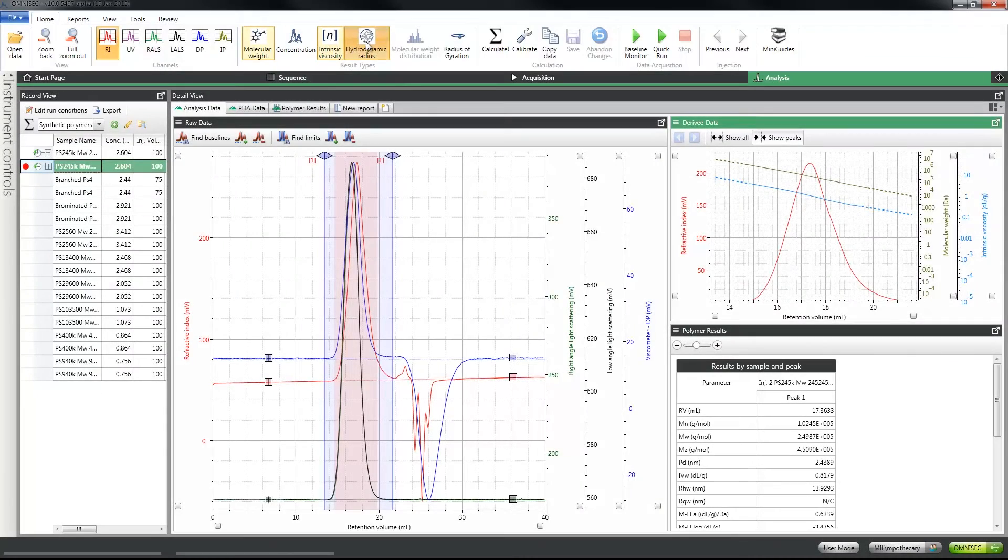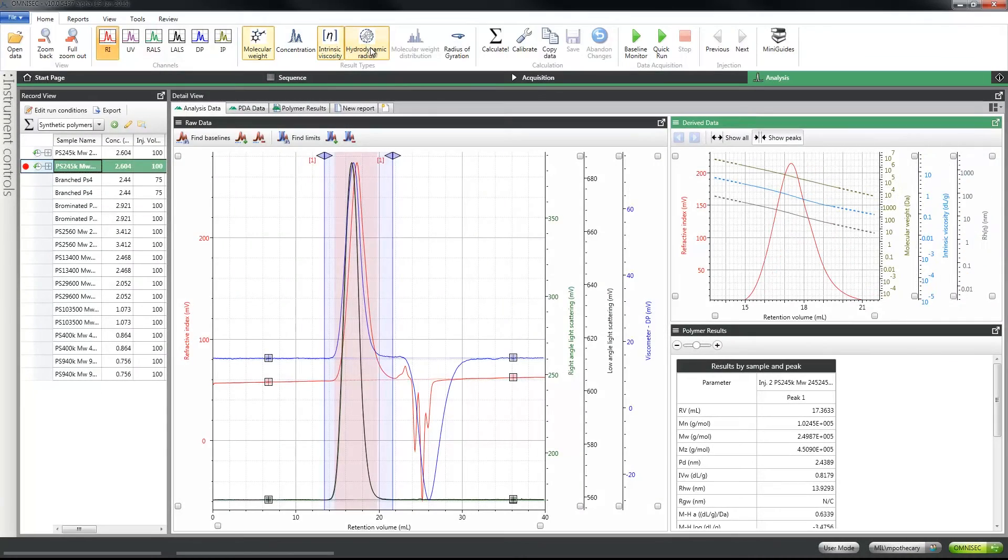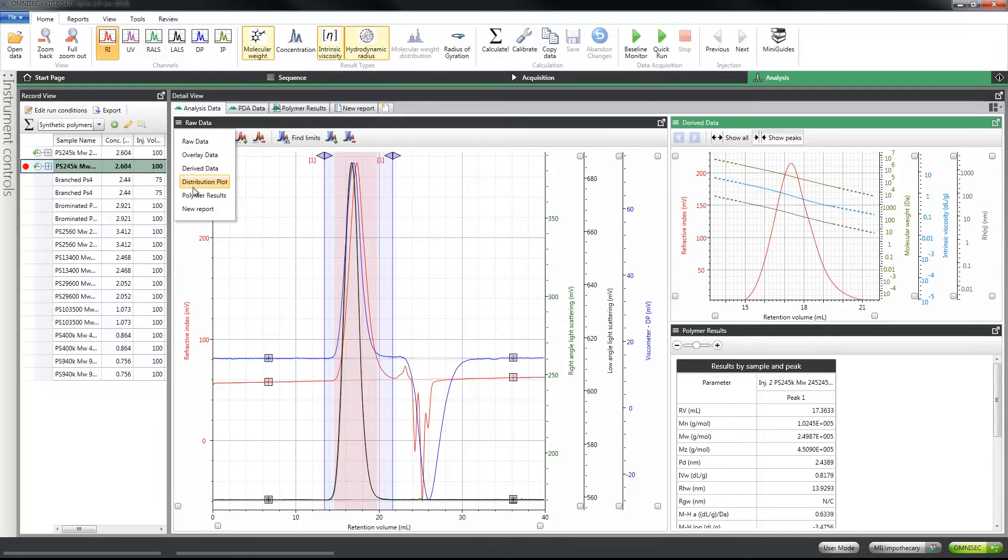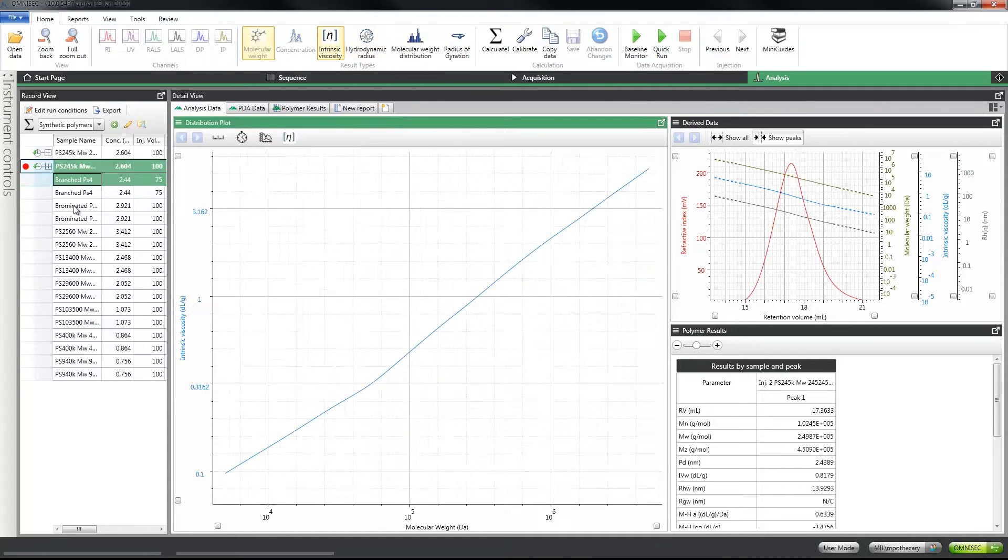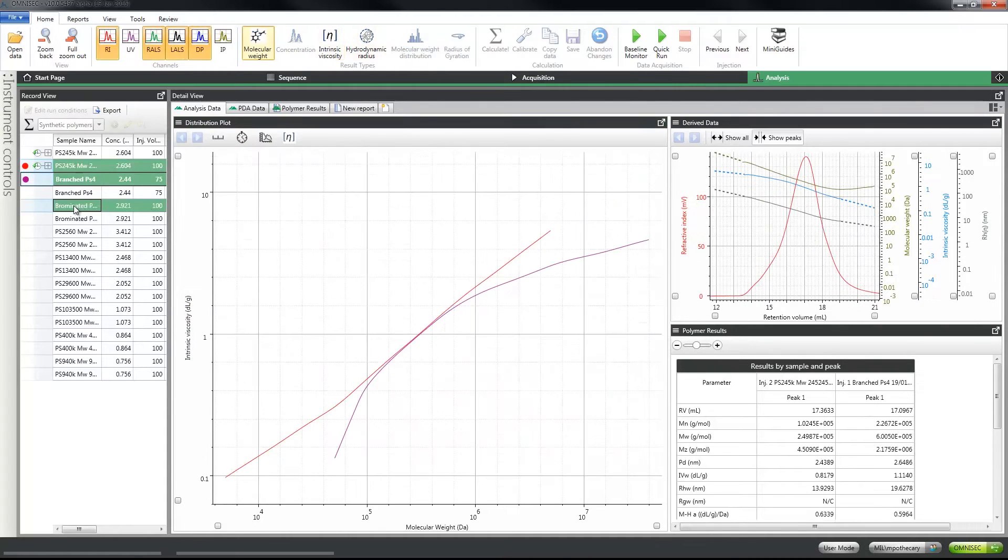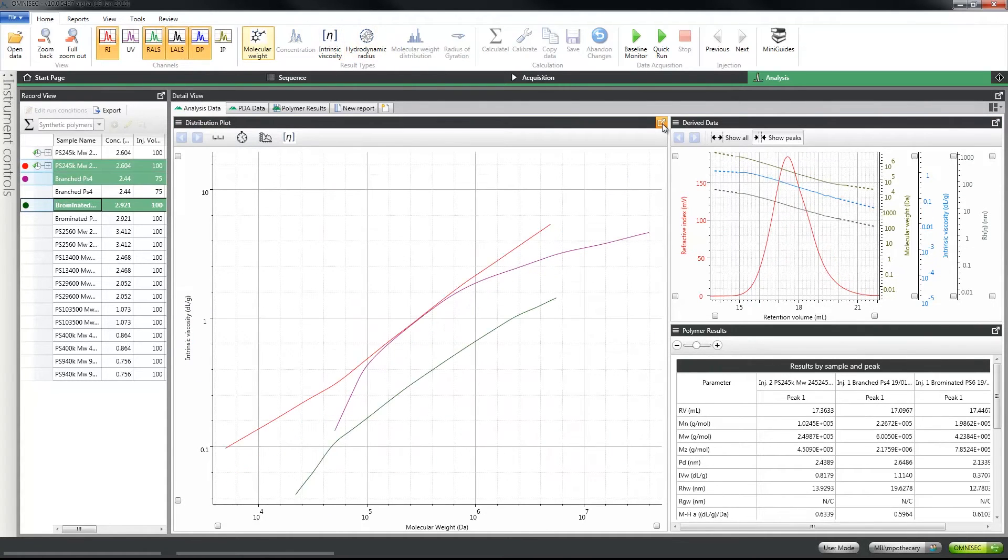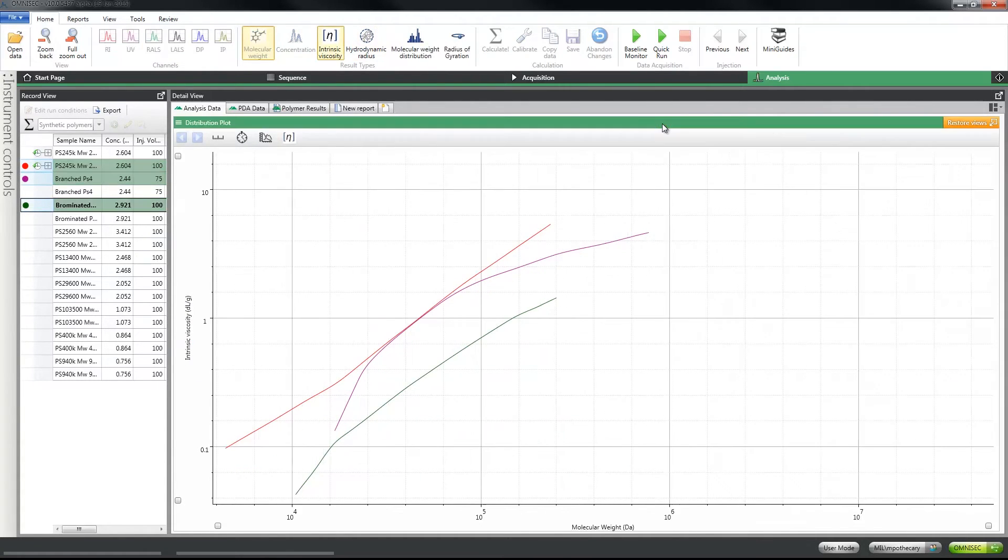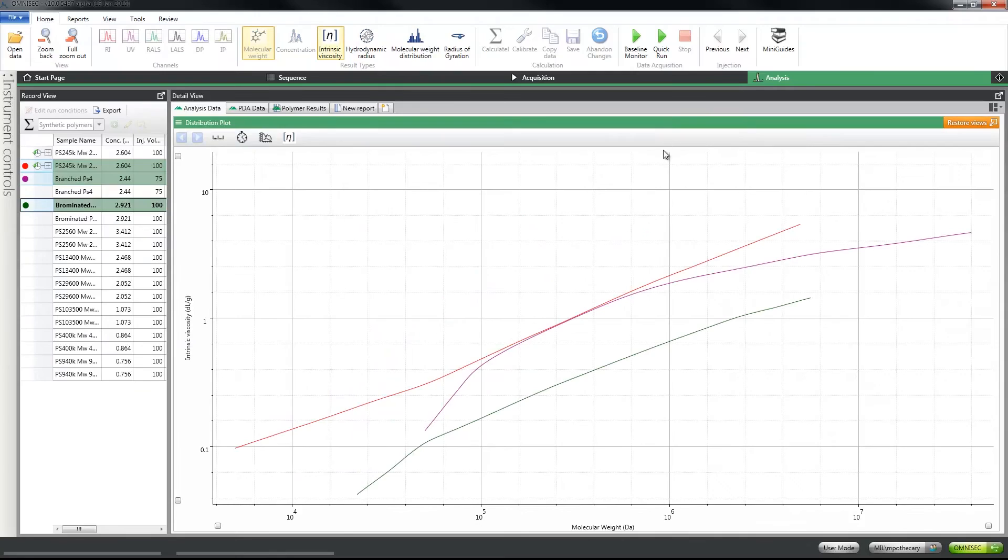It makes the accurate analysis of molecular weight, size and intrinsic viscosity simple and ensures precise Mark Houwink plots for comparison of polymer structures.